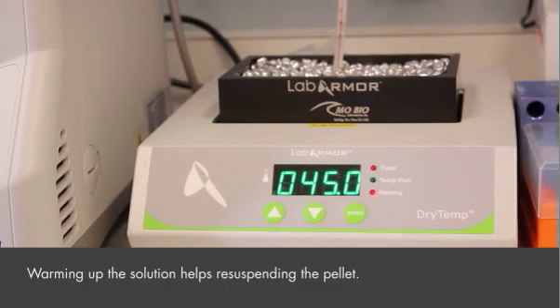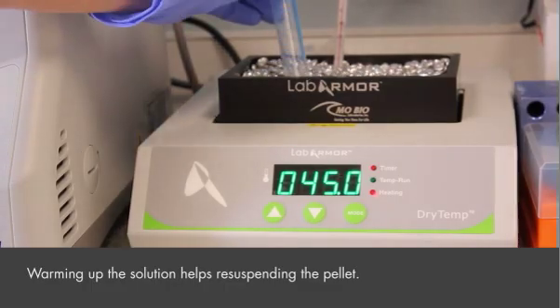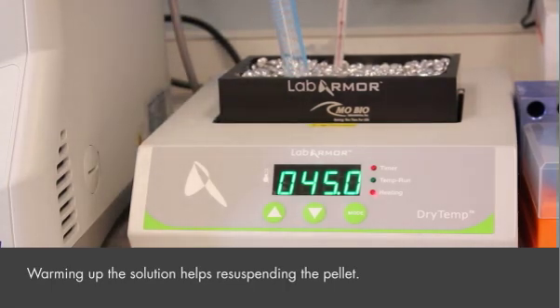Re-suspension may be aided by placing the tubes in a heat block or water bath at 45 degrees centigrade for 10 minutes followed by vortexing.